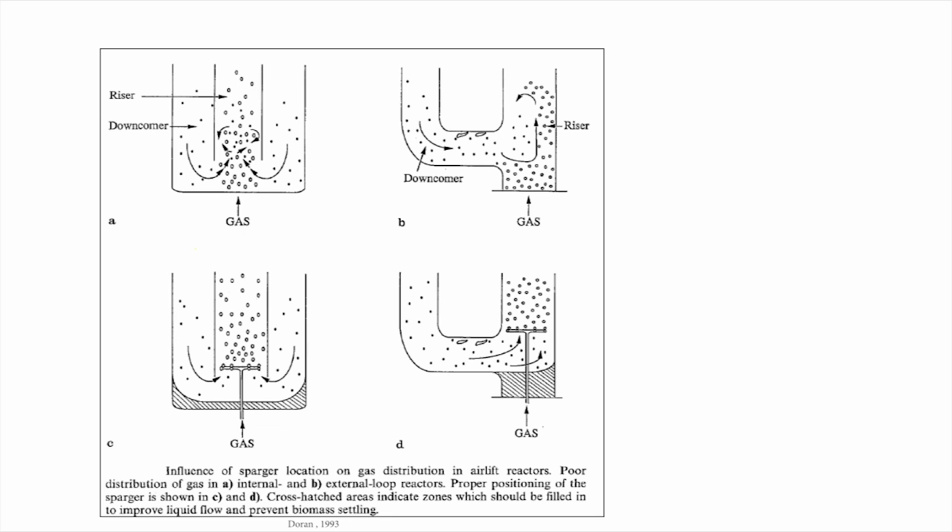The other thing which they have shown here is that the lower edges can be filled rather than keeping them very erect and edgy at the bottom, and they have been made circular, thereby filling them with glass. This will improve the circulation rates of the medium, avoiding the dead zones at the bottom of the reactor.